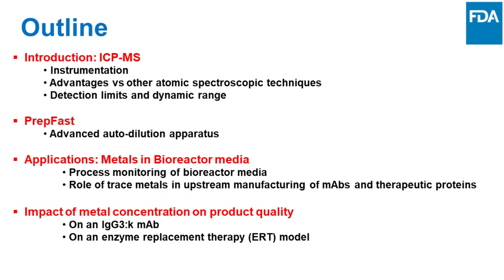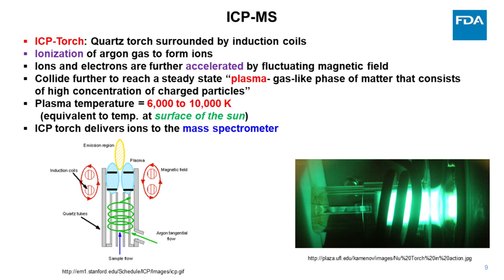This is the outline of our talk, me and Dr. Madhav Rao. I will introduce the technique. I know Robert talked in detail about the ICP mass spec, so I'll go over it quickly, and then I'll talk about the PrepFAS, which is our autodilution apparatus. Then Dr. Madhav Rao will take over and talk about the detailed research we did on the impact of metals in bioreactors and on the quality of the proteins we studied.